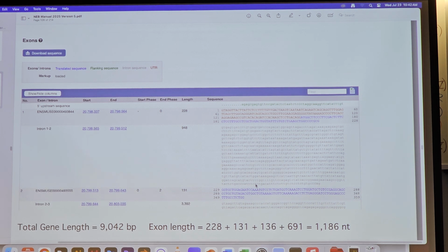Now, we can actually find the beginning of the forward primer. If you go on page 111, I'm not going to do that because I don't want to lose my place here, but on page 111 is the sequence of the forward and reverse primer. The sequence of the forward primer starts ACACA. I'm going to put my cursor right there.